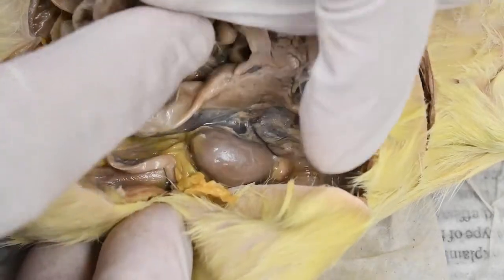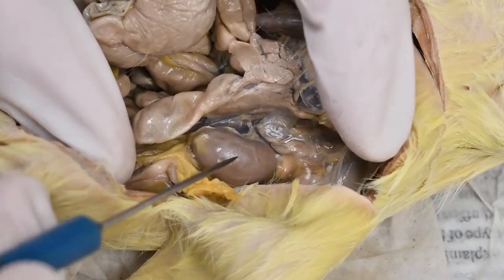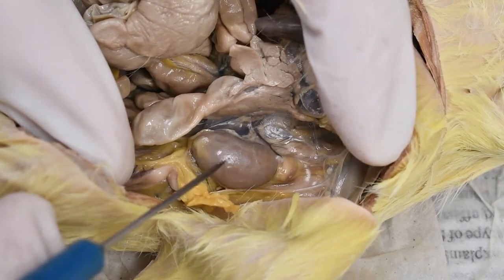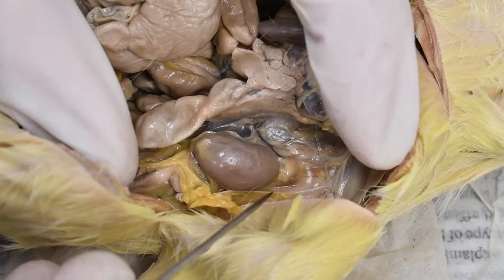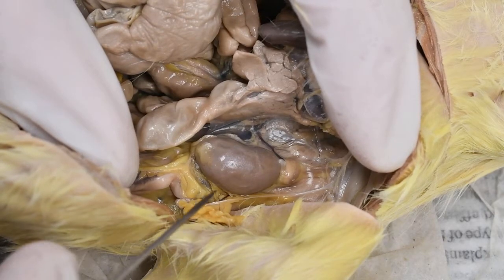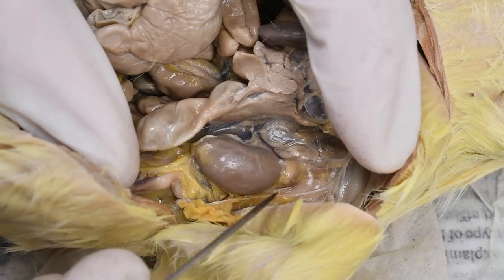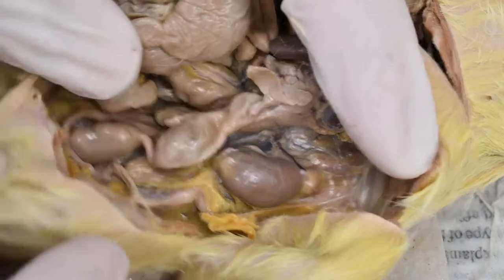All right, underneath that, you can see this big bean-shaped organ here. That's a kidney. And once again, it's actually outside the coelom, although it may not look like it. It's not quite as obvious as it is in sharks, but you do have parietal peritoneum covering this organ.